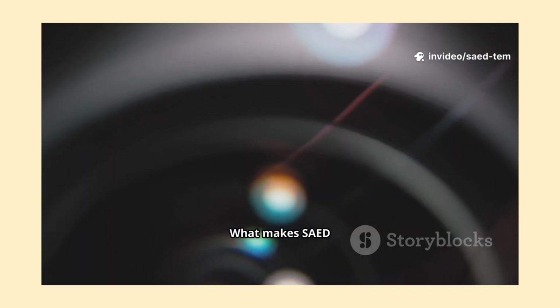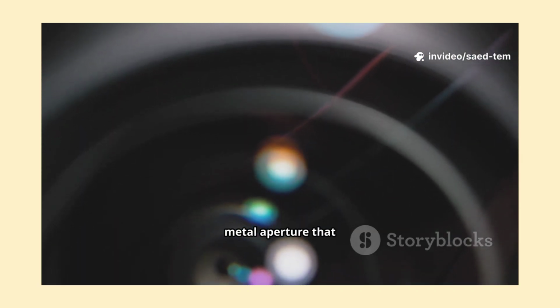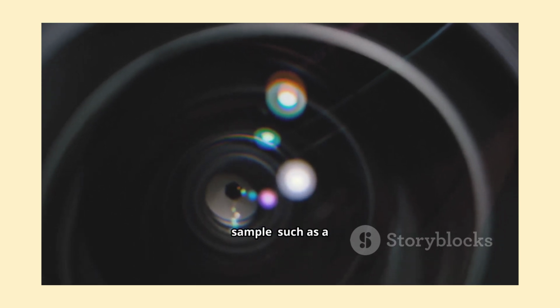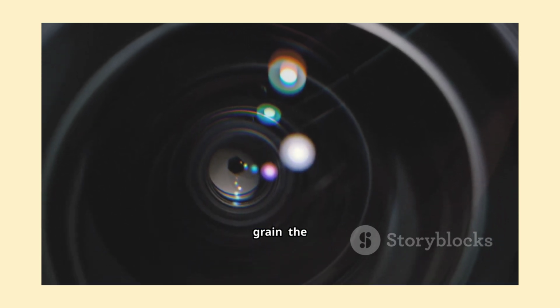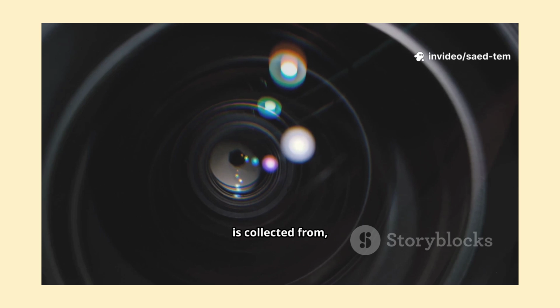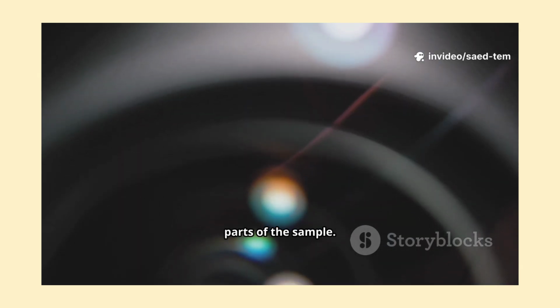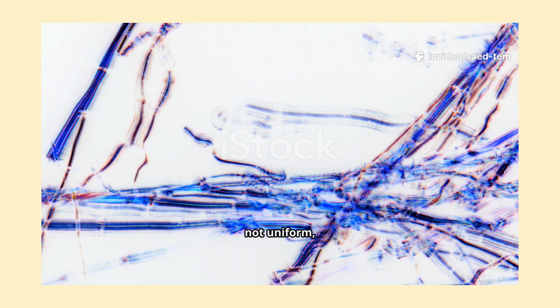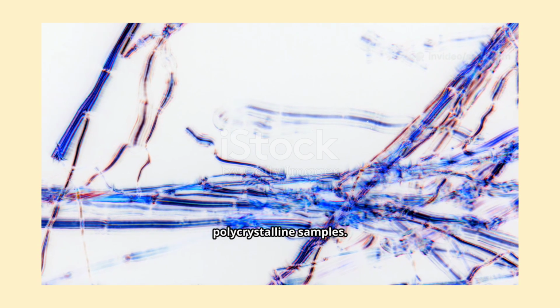What makes SAED "selected area" is the use of a small metal aperture that allows the user to choose exactly which tiny region of the sample, such as a single crystal grain, the diffraction pattern is collected from, while blocking electrons from other parts of the sample. This is especially useful for studying materials that are not uniform, such as mixtures or polycrystalline samples.